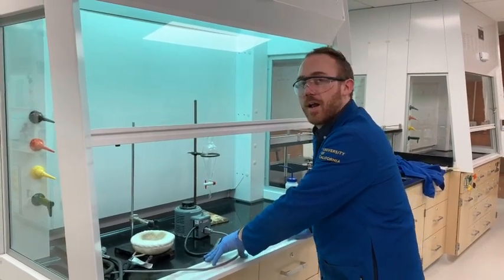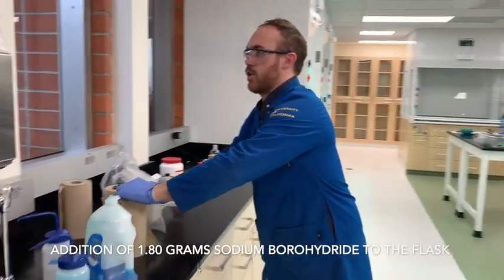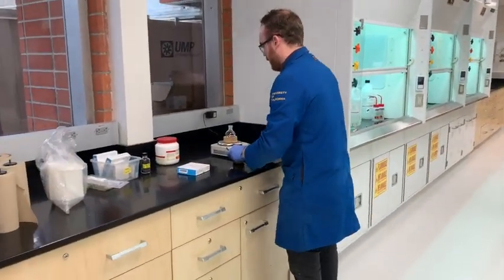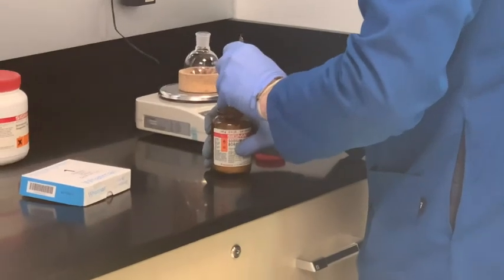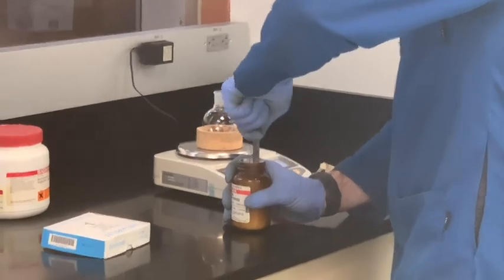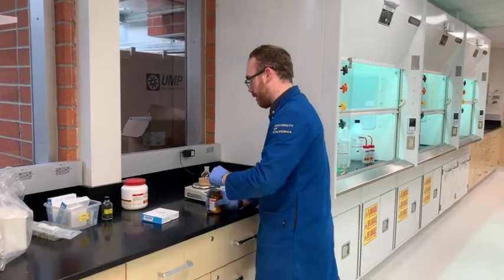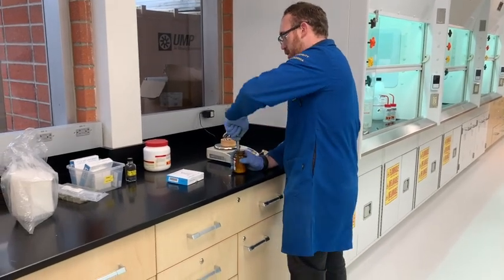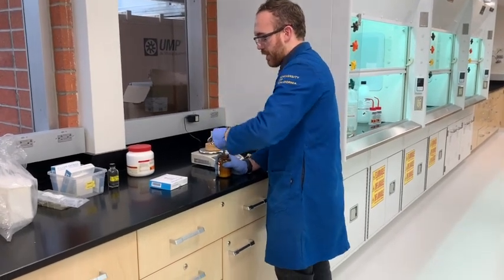What we'll do first is we'll measure out the sodium borohydride into the flask that we're going to be using. Make sure I get a clean spatula. Get as close to 0.180 grams as possible, and just make note of whether there's a little bit too much or too little. If you look at your procedure, you'll notice it says 0.06 grams — in this case, all the reagents are just going to be tripled for this experiment. Try not to spill too much of this because it's pretty dangerous if you mix it with water — it makes a lot of hydrogen gas.